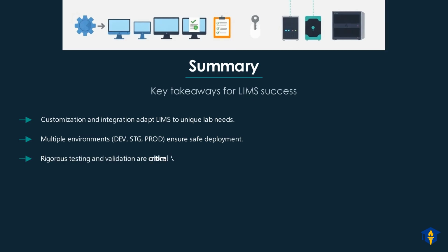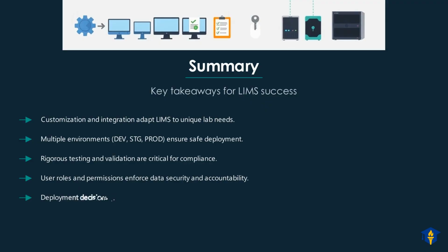Rigorous testing and validation processes are absolutely critical for maintaining regulatory compliance. Properly configured user roles and permissions enforce strong data security and accountability within LIMS. Your deployment choice, whether on-premise or cloud, significantly impacts both cost and scalability.